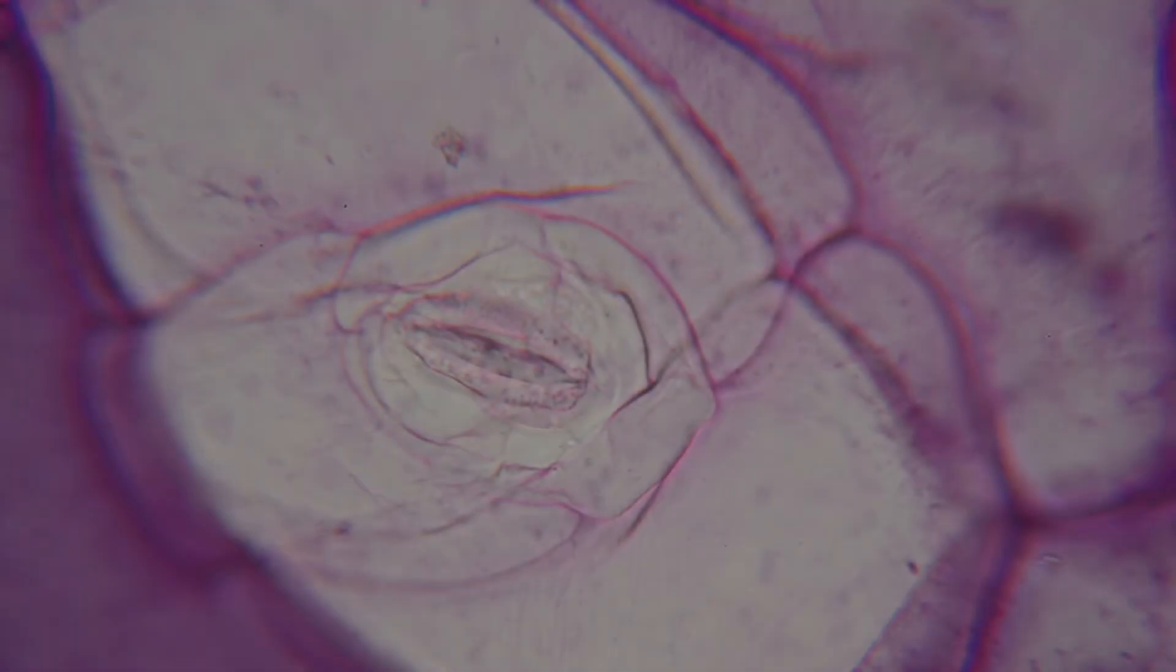Hi, I'm Alex and today we're looking at stomata on the underside of a leaf.